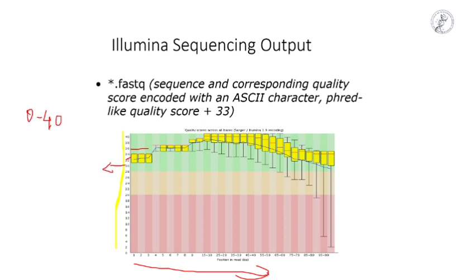But when it comes to the last sequence, you can see the error bar in the lower quality area, about 20. 20 is low quality. So coming to 60, 75 base pairs, the quality of the sequence becomes deteriorating, as we can see from this graph.